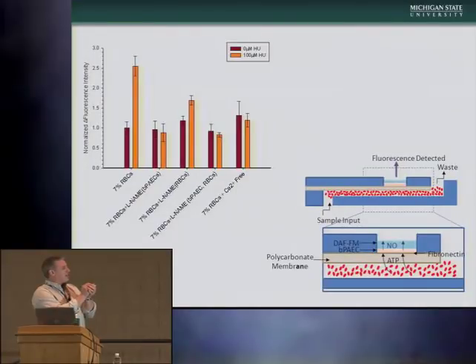We know it's nitric oxide in the endothelium because when we add L-NAME to the endothelium, you see here in the orange bar, we can knock down the nitric oxide production. Interestingly, if we add the L-NAME to the red blood cells and inhibit the red cells' ability to make the nitric oxide, we also see a significant decrease then in the endothelium NO. When we put it in both the red cells and the endothelium, we don't see any nitric oxide.